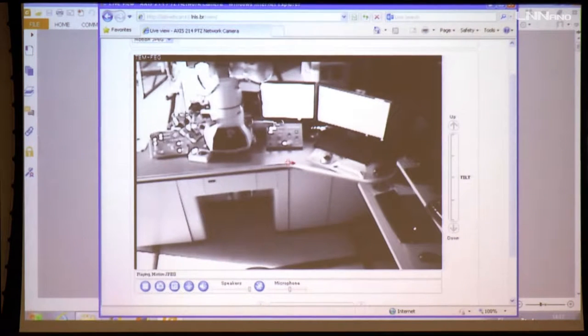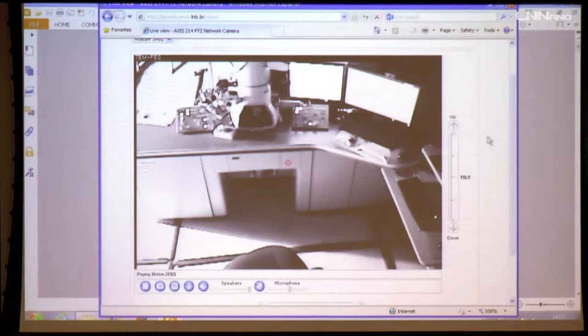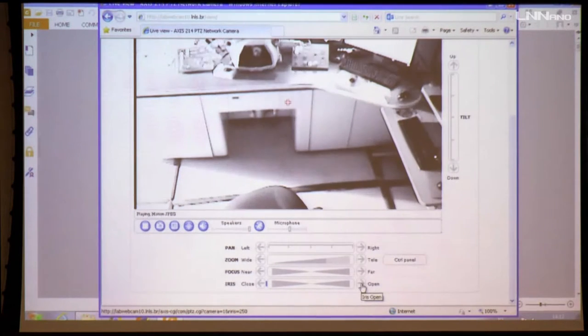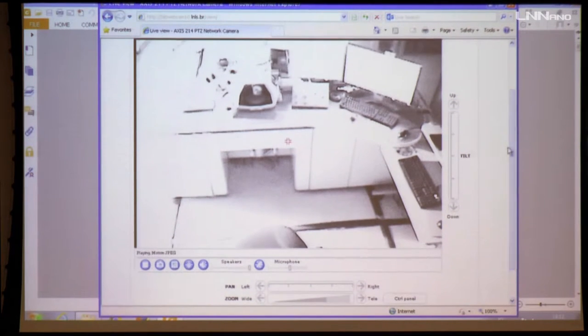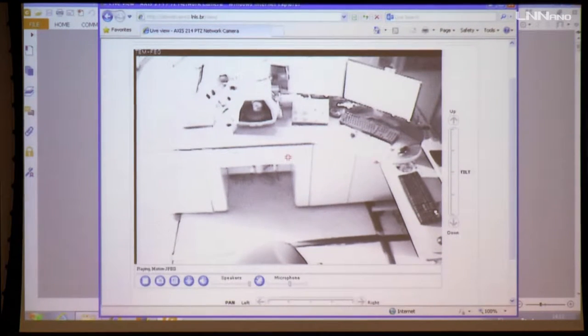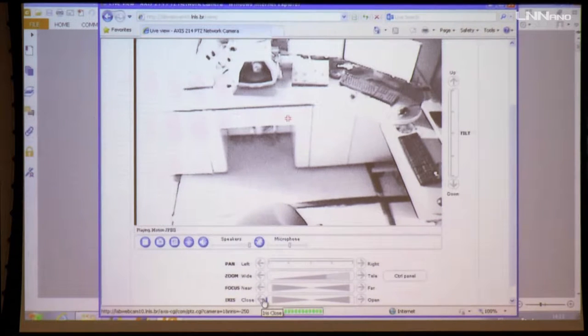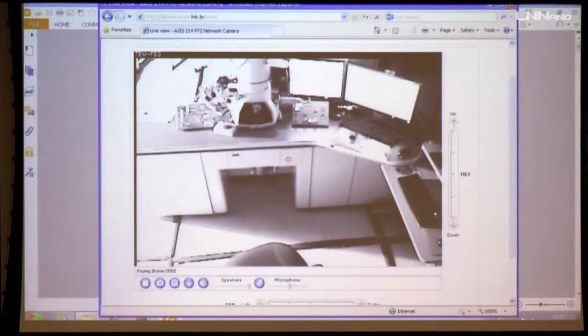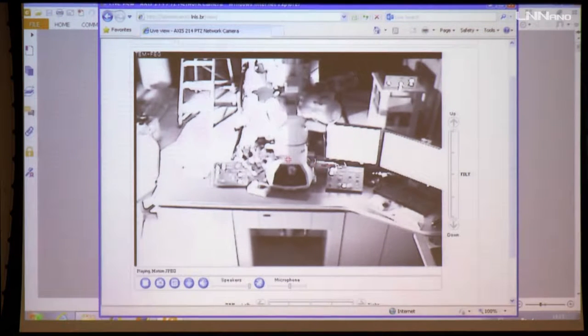A few more things that I haven't shown in my talk are the tilting. We normally tilt the sample using these pedals provided for one side, x plus and minus in the x direction, and y plus and minus in the y direction. Underneath is a GIF camera. So this TEM has two cameras, one on the top and one at the bottom. The top camera is located here. I believe it's too much contrast, so I will reduce the contrast. Okay, this is the top camera. I will be using this camera for doing all the alignment process.